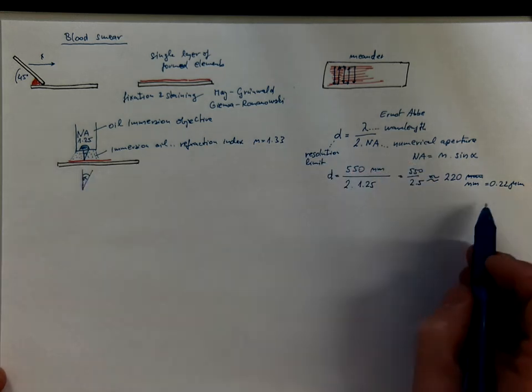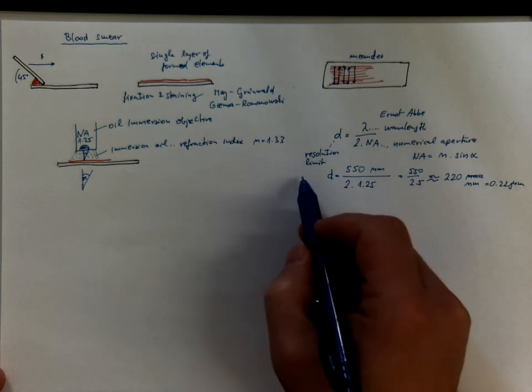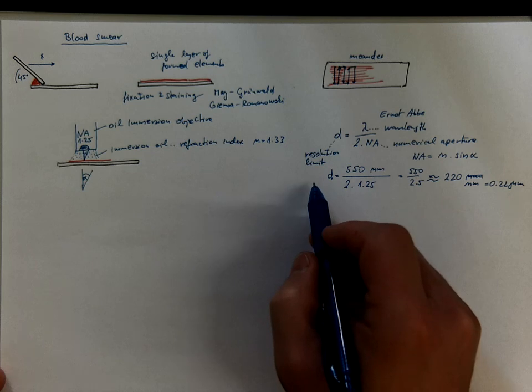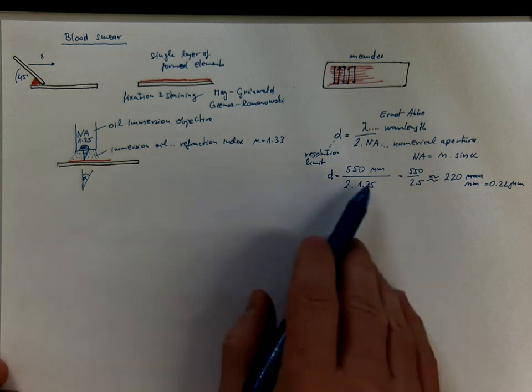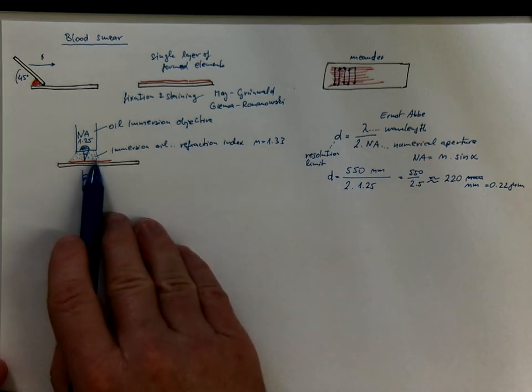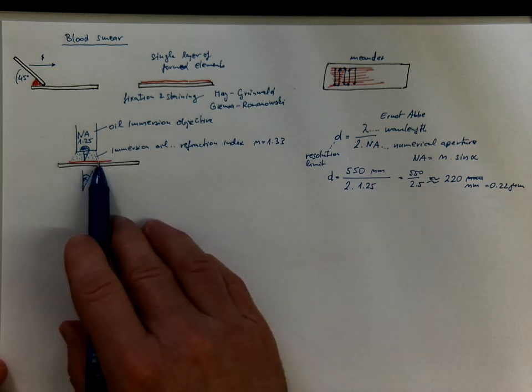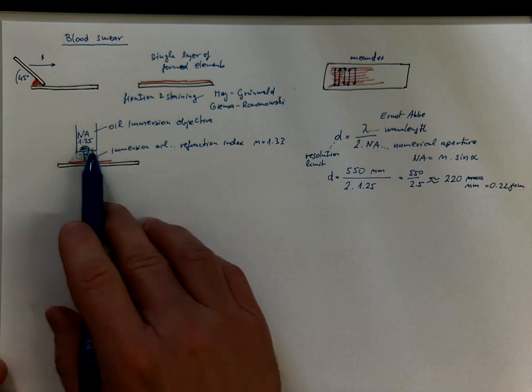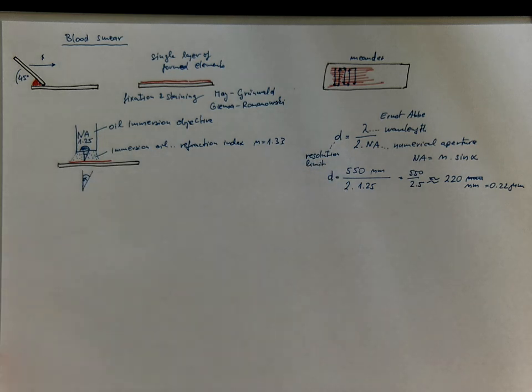of your observation. Of course, the real resolution limit would be worse, and the resolution is defined as the distance between 2 objects that could be discriminated as separate objects, not merging into a single one. So this explains why we are using this technique, why we need it, because for good observation we need lots of details that cannot be increased only by the magnification of the objective, but what we really need to improve is the resolution. That's why we use the oil immersion objective observation technique.